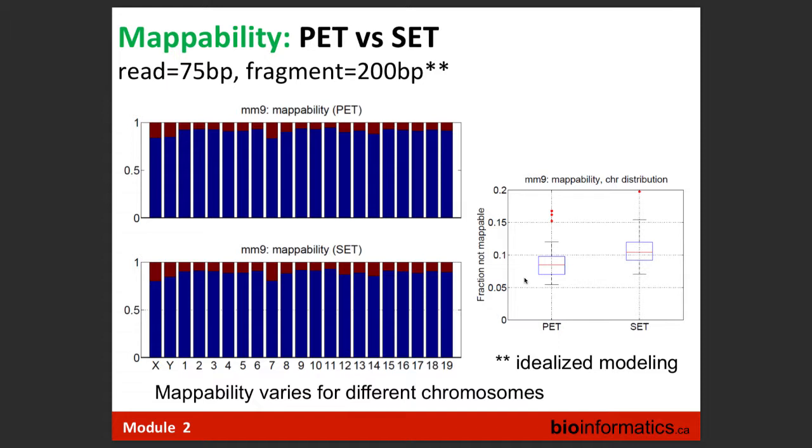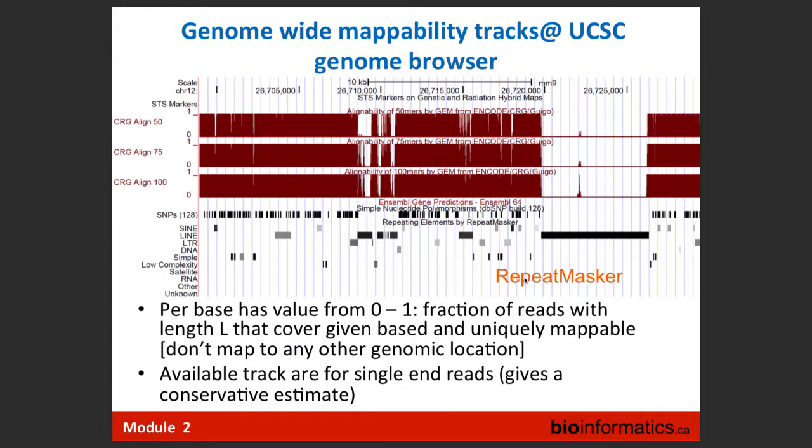And why is mappability, knowing mappability very well, important for us? Like the question to you: say I just ignore and get rid of those reads which are multi-mapped and don't care about them at all. Why is it important for us?